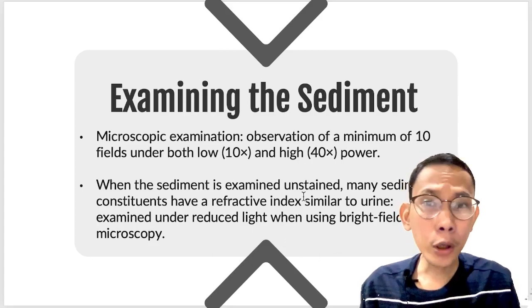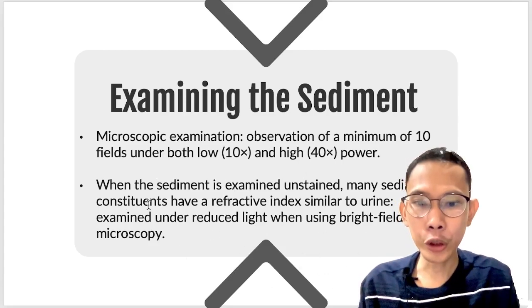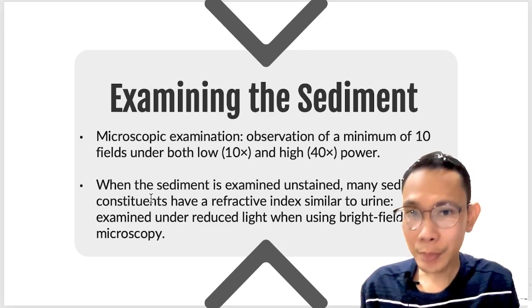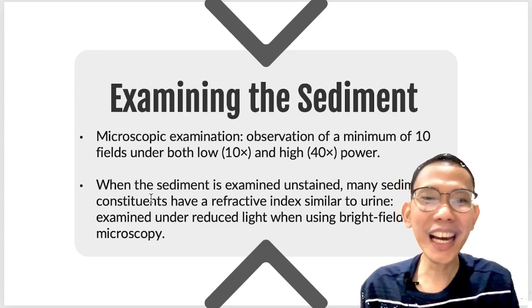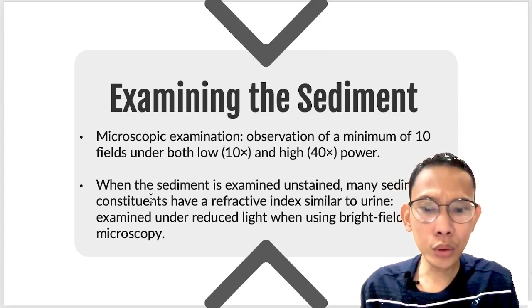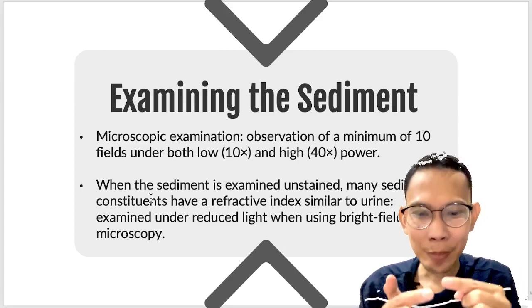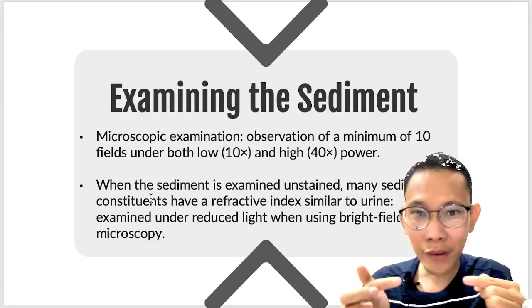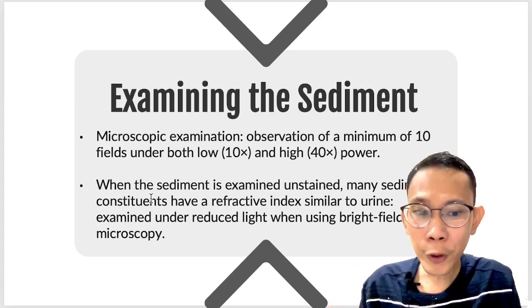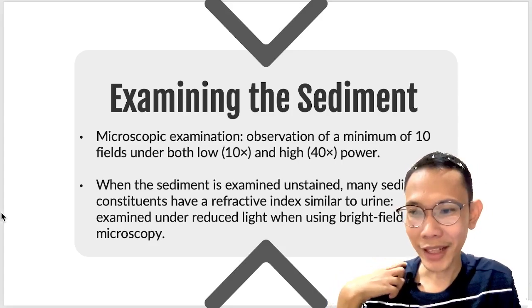Again, this is more of your techniques and strategy while using your microscope. So, you learn from this. If a conventional glass slide method is being used, of course, yan yung ating gagamitin, yung conventional glass slide, your casts have a tendency to locate near the edges of your cover slip. Ito yung sinasabi ko. You look at the side of your cover slip later on. Baka there will be cast na napunta doon. Therefore, low power scanning of the cover slip perimeter is recommended. Okay?